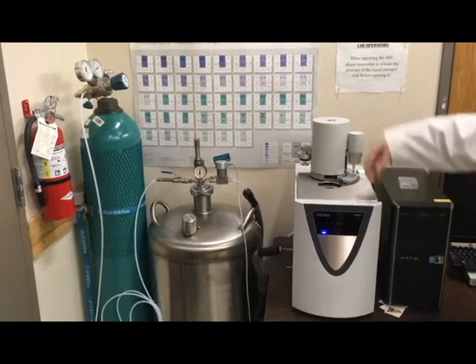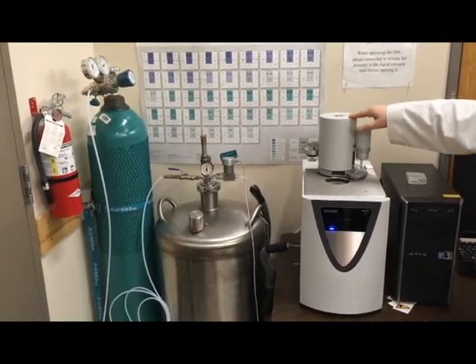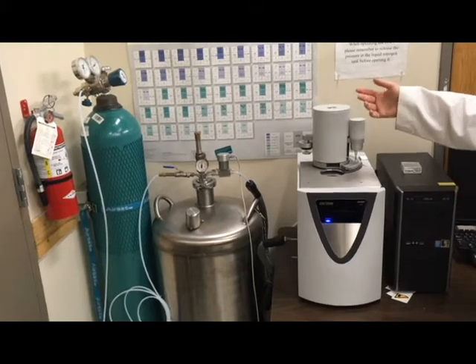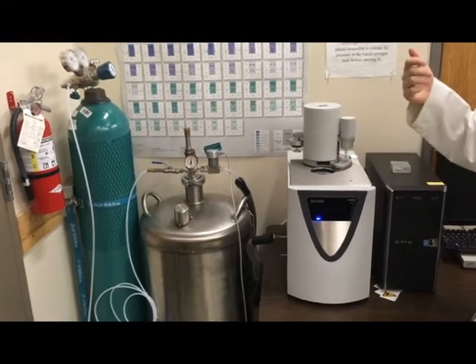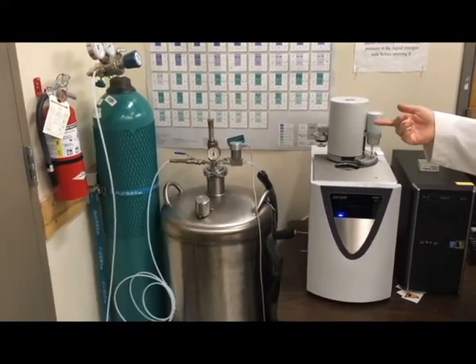This is the DSC right here. We have an auto sampler on top, meaning we can do up to about 19 or 20 samples without you having to babysit the machine — it will automatically put them in and take them out. The DSC has nitrogen flowing through it: liquid nitrogen to cool it, and also gaseous nitrogen which serves to create an inert atmosphere around your sample.